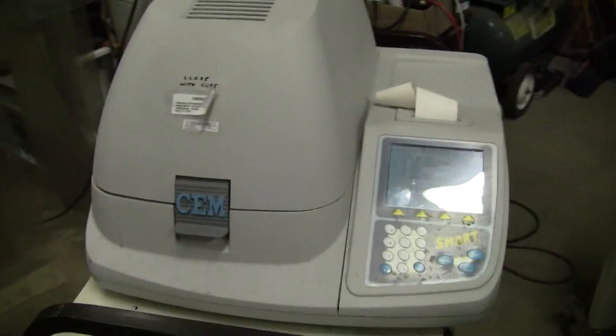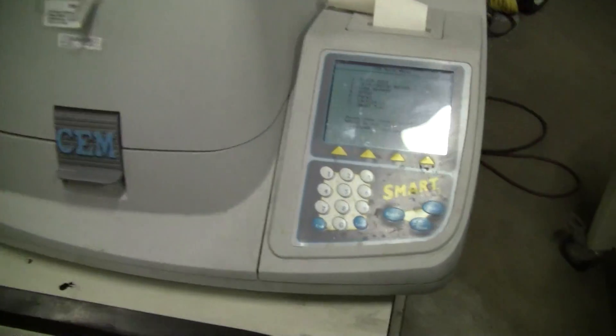Hi, this is Michael Natal from Hitech Trader. Today we're looking at the CEM Smart System 5.